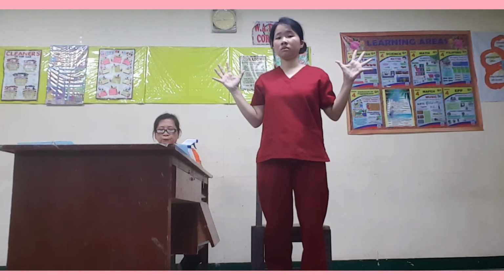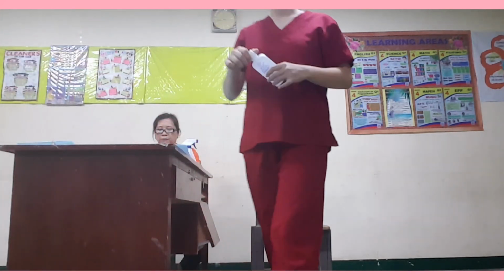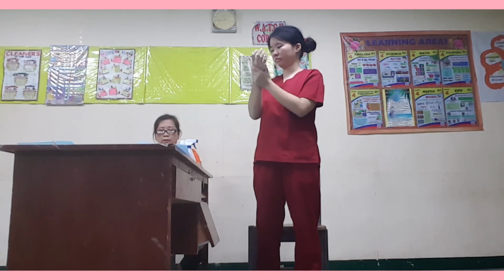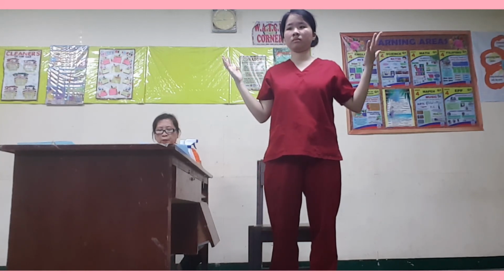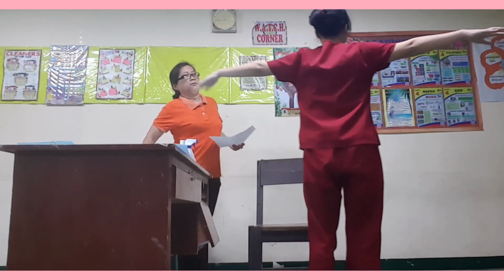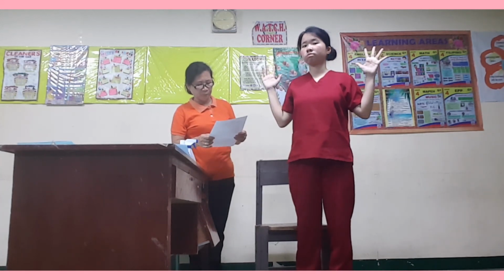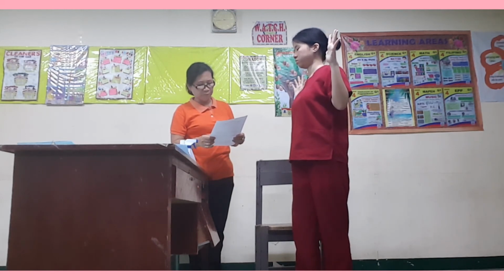Procedure number 21. Perform hand hygiene. Use alcohol-based hand rub (ABHR) to prevent the spread of microorganisms. Procedure number 22. Inspect for any contamination. Recall the possible measures you may have forgotten, and inspect for any contamination you might have interacted with before leaving the area.